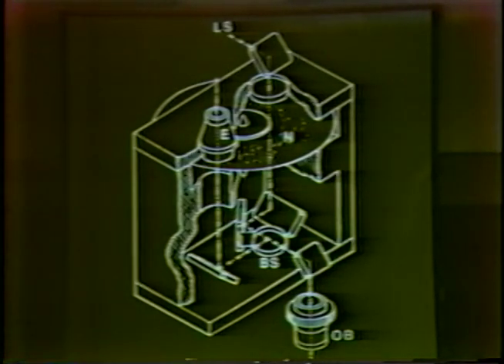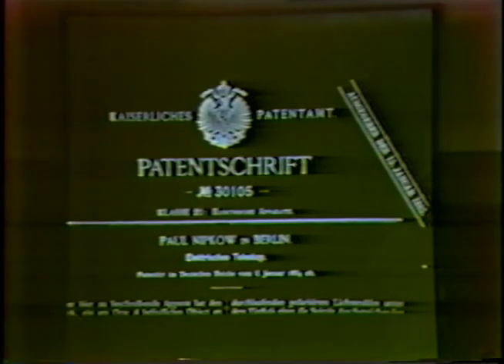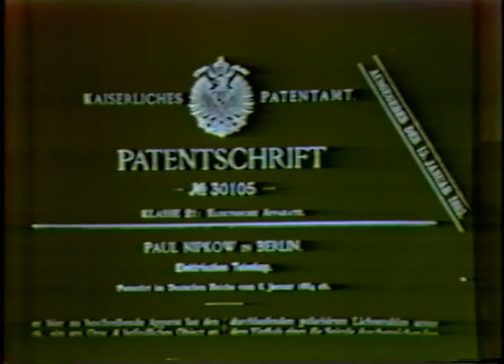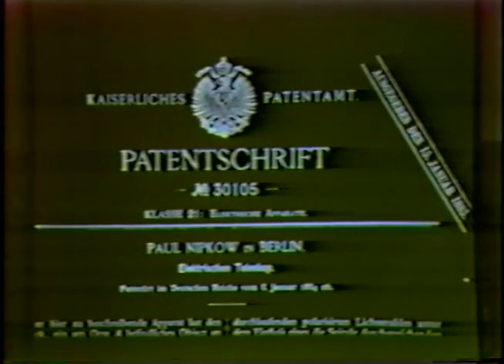And now, just as in Minsky's diagram, we have a one-to-one correspondence between illuminating aperture and detection aperture, but in this case we have 1,000 points or so illuminated and detected simultaneously, so essentially the whole device starts off by being 1,000 times faster. And that actual frame speed is determined by the disk rotation speed. The disks can be cranked up to speeds we don't know what the limits are yet, but it's certainly possible at the moment to have frame speeds of several hundred frames per second, and that can almost certainly be put up to several thousand frames per second.